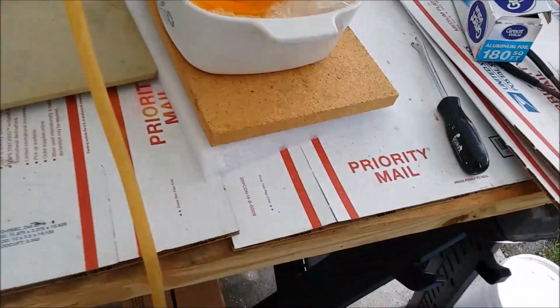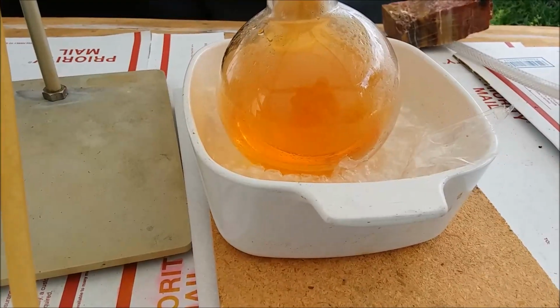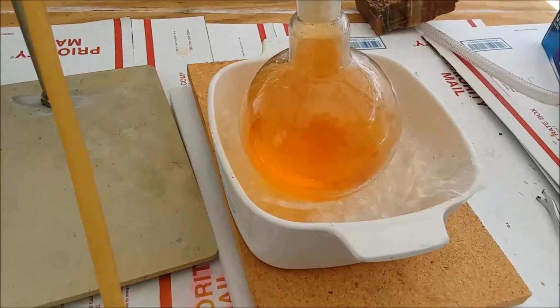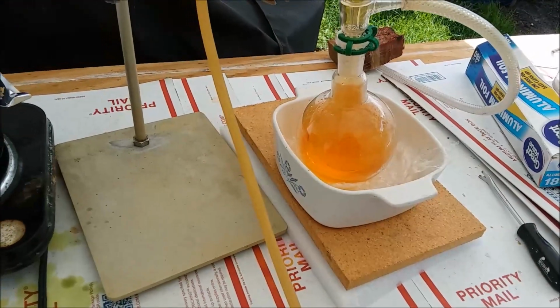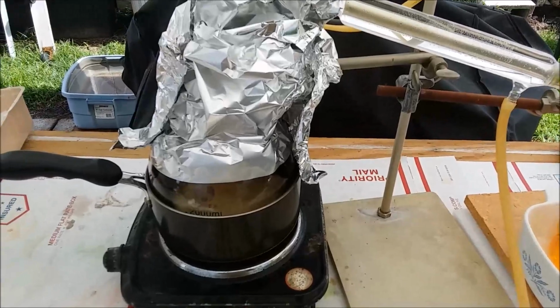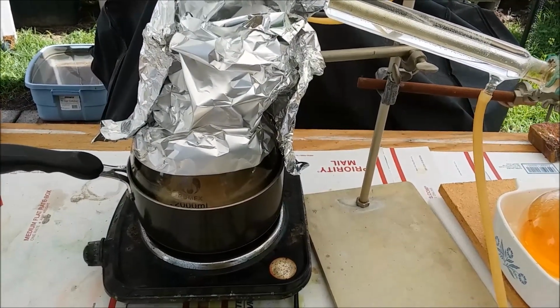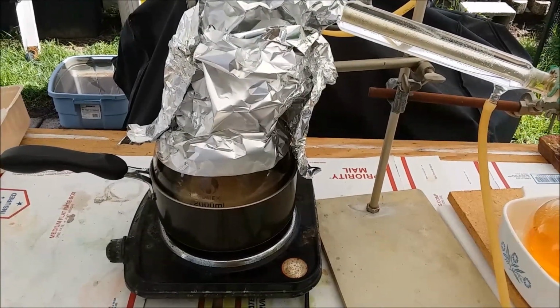and collect some more. Got a good little bit in there right now. Going to add to that. Probably at least another 100 milliliters based on experience from what I get out of the 1 liter flask. So I'm going to need to put my personal protective equipment on and pay close attention to what I'm doing, so I probably won't film them swapping out the flasks.